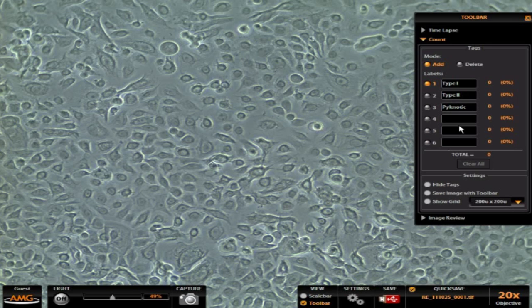Once I have my categories defined, I can select one and then I'm free to click on a cell and it's going to put down what we call a tag on the cell. So these are my type 1, these are rounded cells. I'm going to click and put these tags down on the cells.